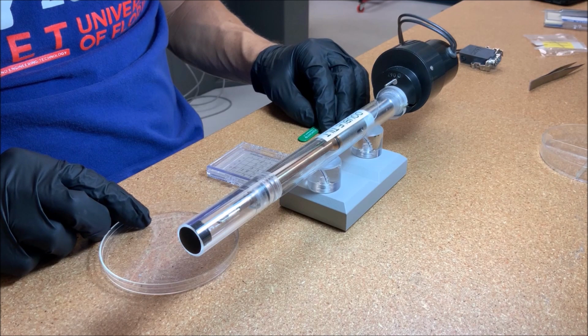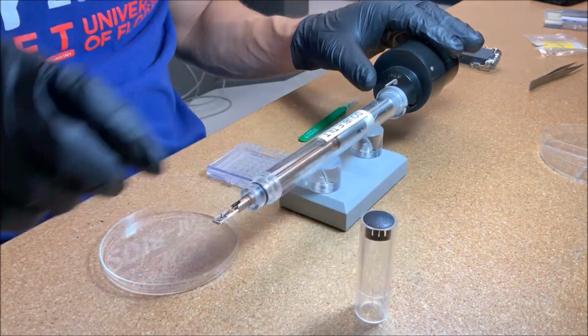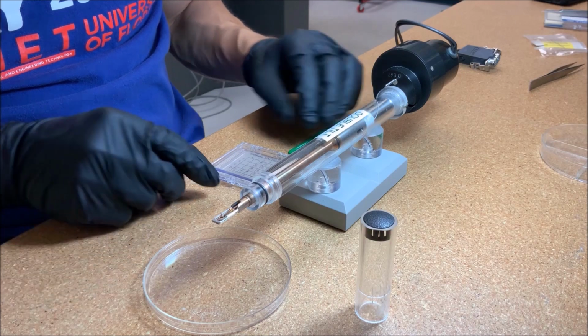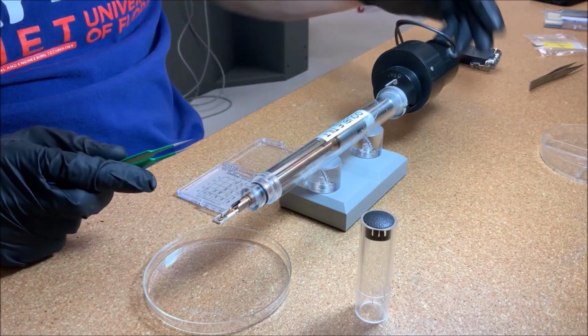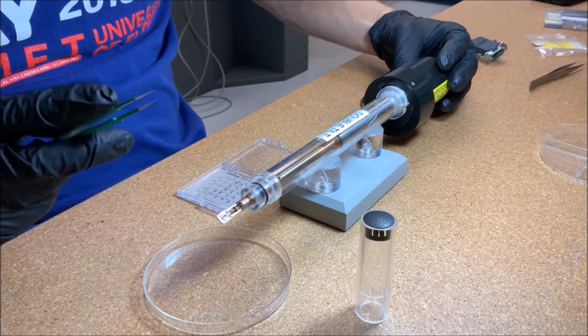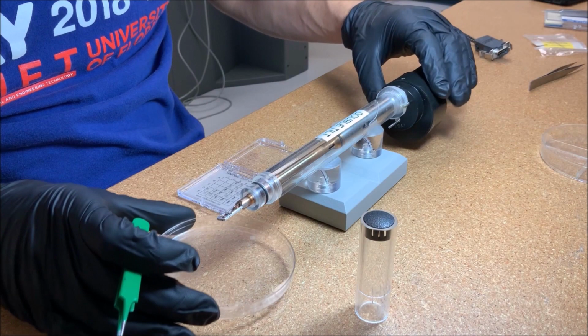To unload the double tilt clip holder, remove the protective cap from the support base. Then place a dish under the basket. Rotate the holder upside down to expose the small hole on the right side of the basket.